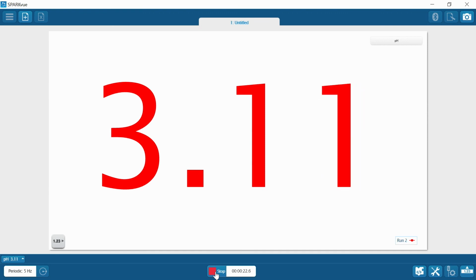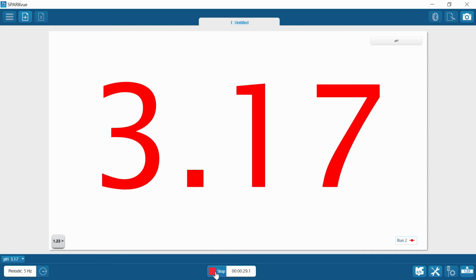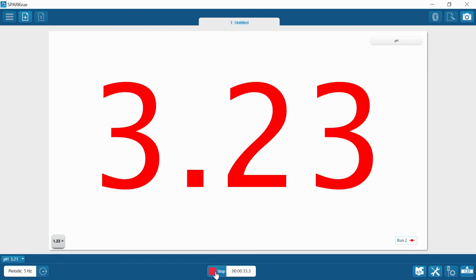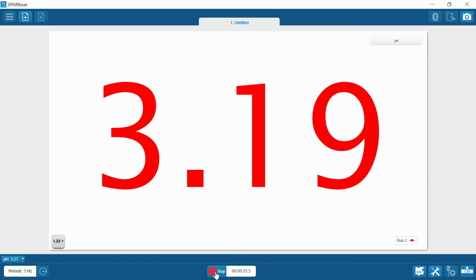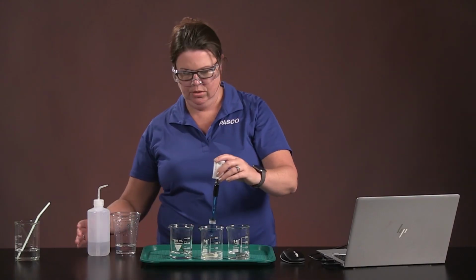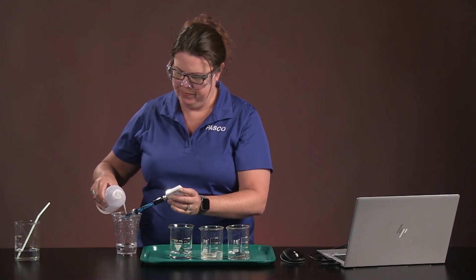Still going up. Okay, about 3.2, 3.3, hovering around there. That's pretty interesting. Stop. Rinse one more time.